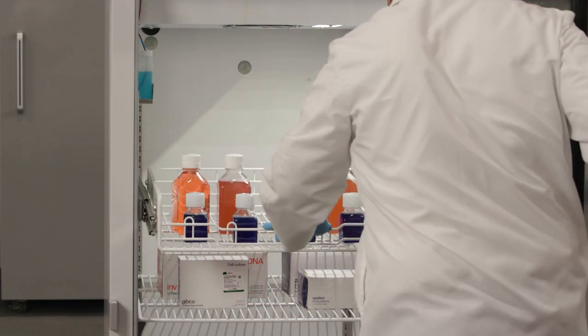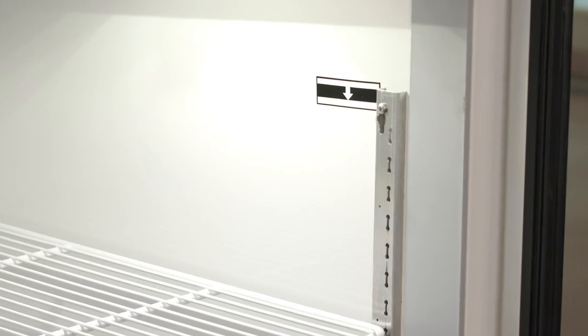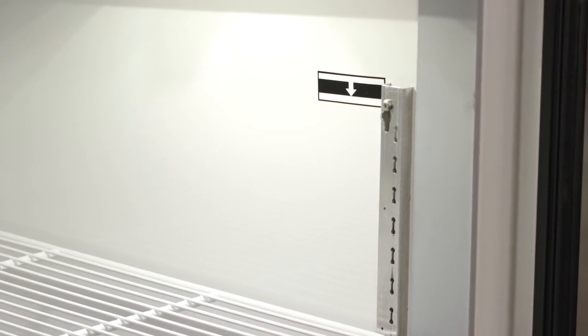Do not overfill the refrigerator, especially near the upper part of the chamber. Observe the load limit line. Do not store any items that exceed the height of the load limit line. Place items evenly inside the refrigerator to help maintain air circulation and temperature uniformity.